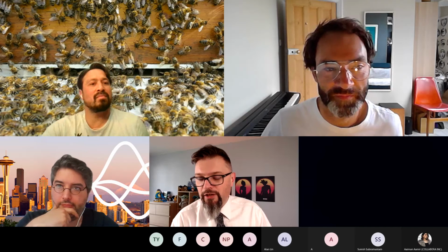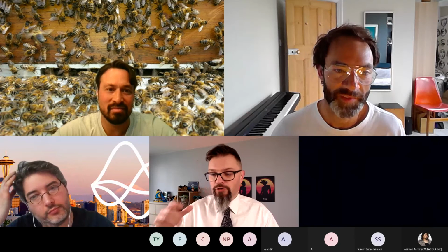And another next step, and it's more my part. I am less of a data scientist than Jonathan. It is to have, for example, a microscope and try to implement the automation of the microscope. I'm not a specialist in microscopes, but I know that some microscopes have an API, so we can command and control the microscope.